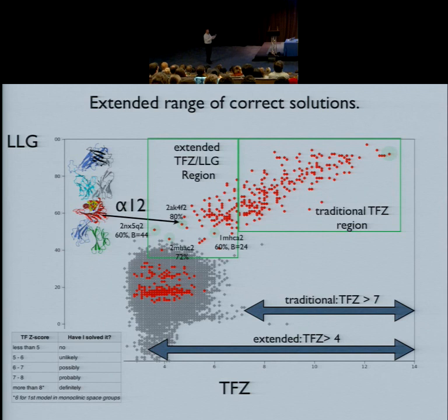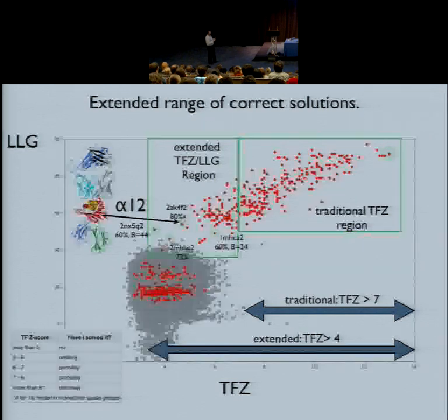And when you're looking at this analysis, you can try to cluster the top peaks and check if they correspond to the same fold, and this would be another confirmation.